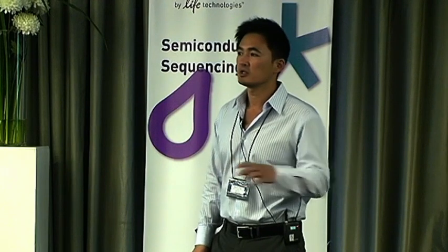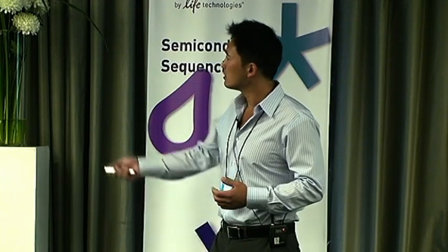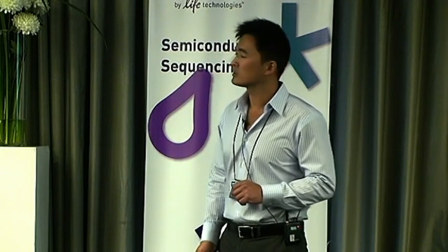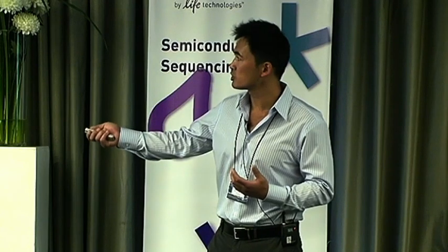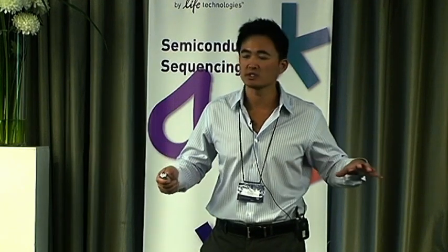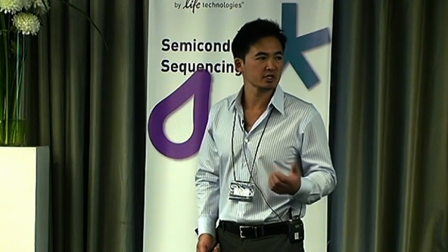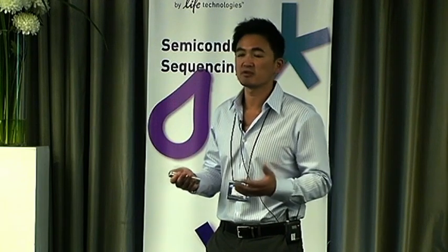All of these could be run on, let's say, the 7900 real-time instrument. I don't know if you guys have those in your lab. This is the ViiA 7. This is a newer real-time instrument that we have. This instrument was very popular because of the flexibility, right? You can actually see I'm showing multiple thermal cycling blocks next to this instrument. And the reason why it was popular is because a researcher can easily switch the blocks. So now you have a system that's very versatile.